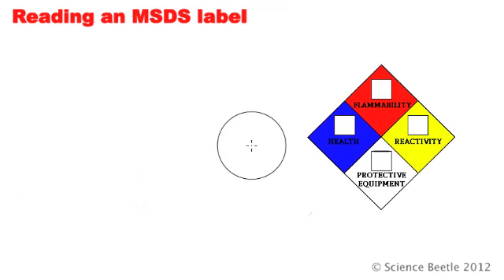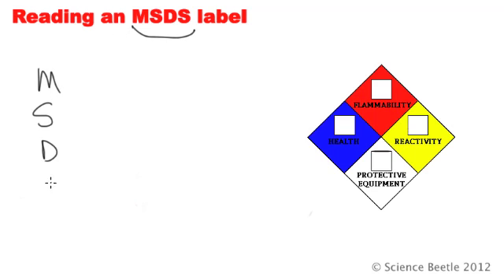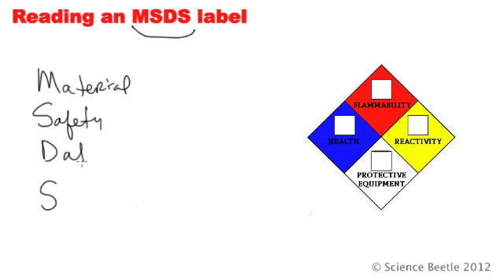MSDS is the acronym used to describe several things. M stands for Material, S stands for Safety, D is Data, and then the final S is Sheet. This MSDS, or the Material Safety Data Sheet, essentially provides you with a very comprehensive list of things that you should know about in terms of safety.